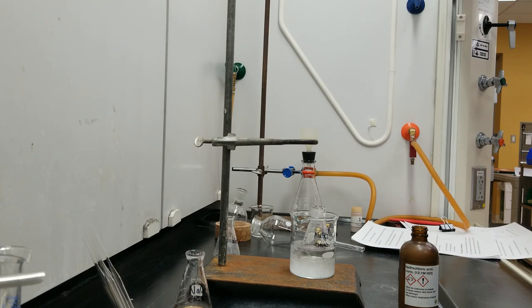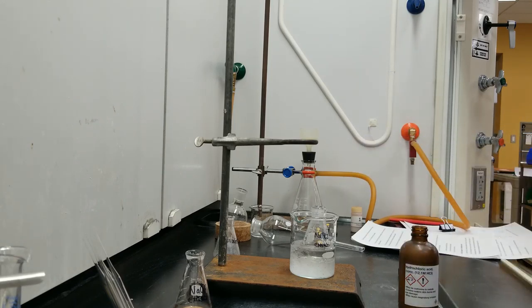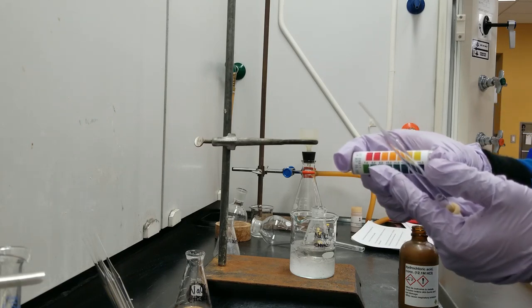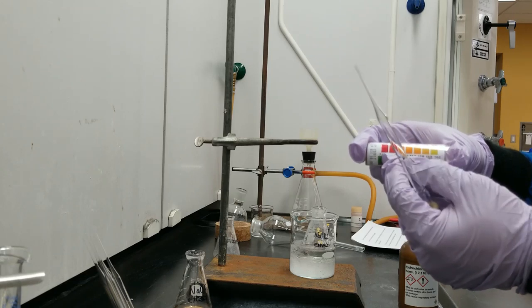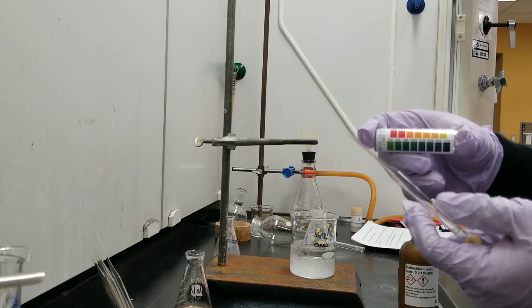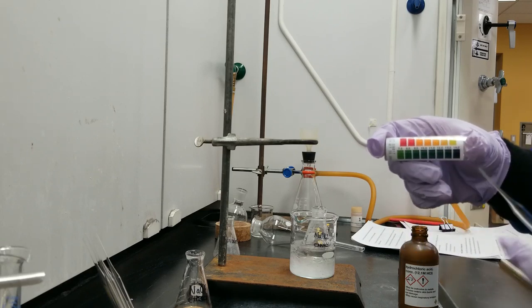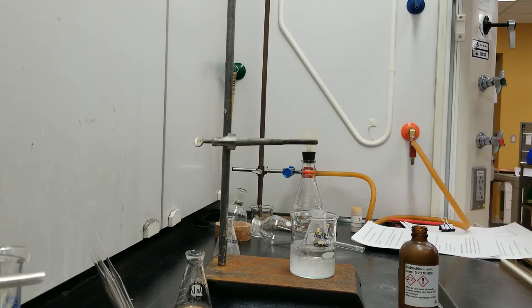until the pH of the solution gets to 1 to 2. And we'll be using the pH strips for checking the pH of the solution. As you can see, pH 1 will give you a red color and pH 2 will give you an orange color. So we are going for the red color of the pH strip.